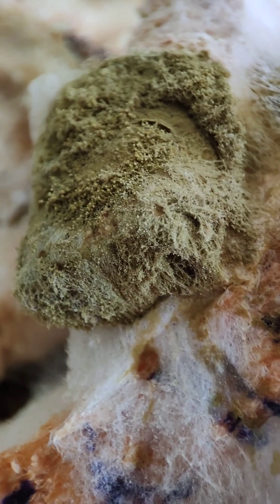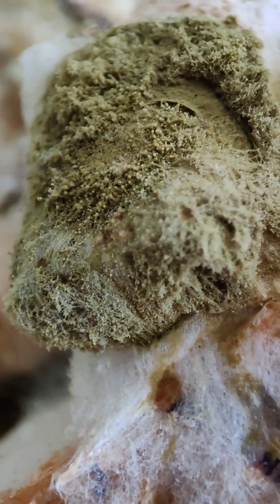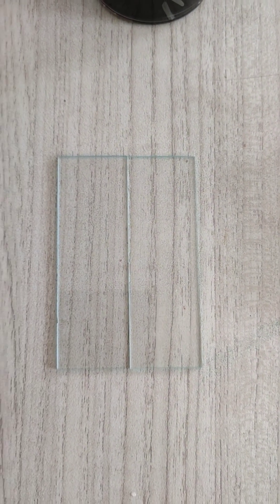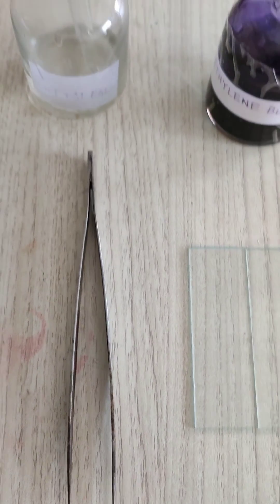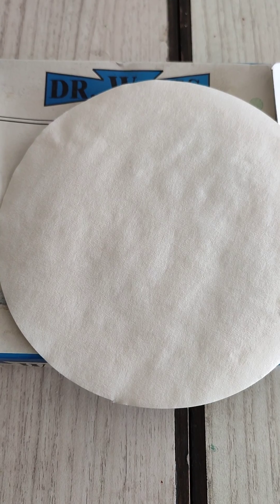Now we prepare the slide of Rhizopus or bread mould. For this we need some requirements. First is slide, then glycerine, methylene blue, filter paper, and needle.